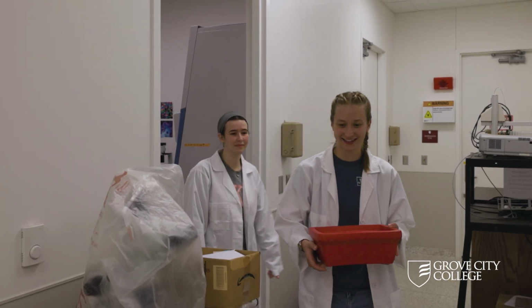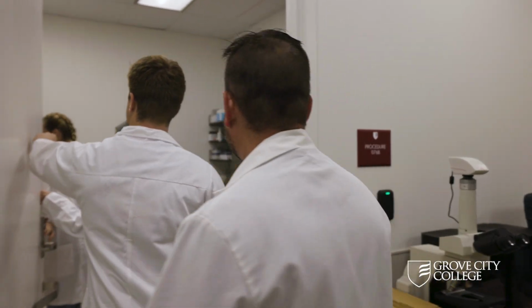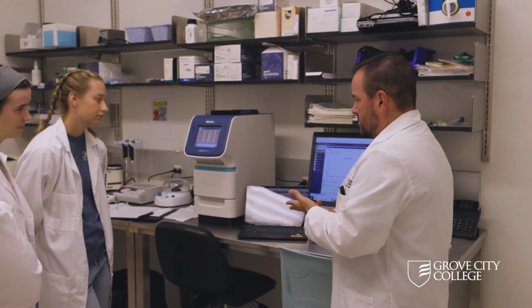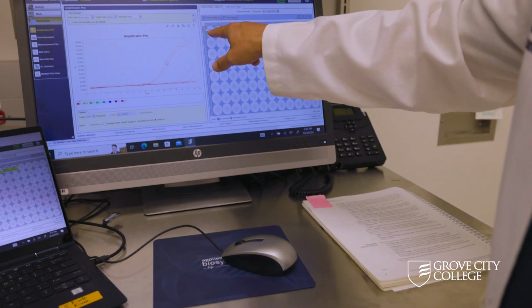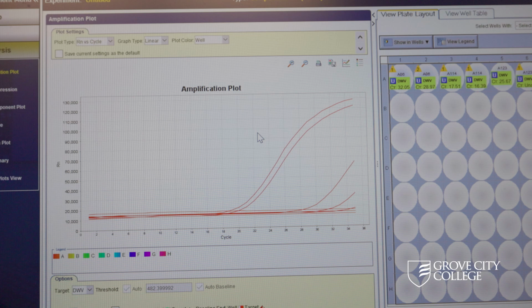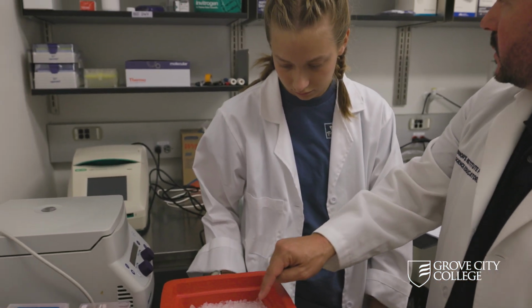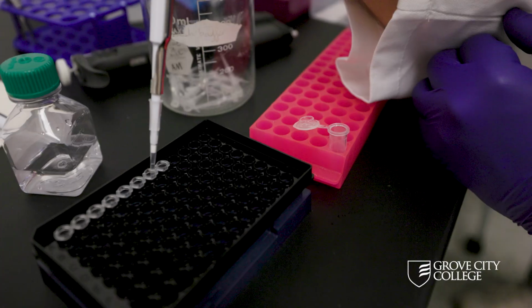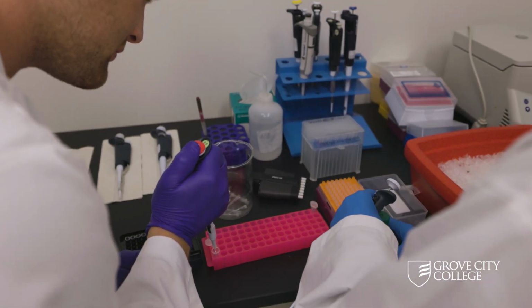So we did a collaboration with another professor in my department. Dr. Yaller volunteered to help us take our samples that we're getting out in the yard into the lab and actually test them utilizing a real-time PCR machine that we can use to detect this RNA virus. What we're doing is taking positive controls of deformed wing virus, and we're running these curves against samples from our own hives. The PCR machine tracks the amplification of the RNA.